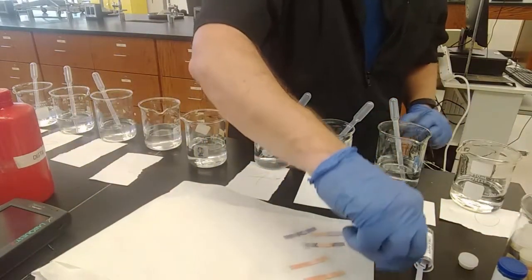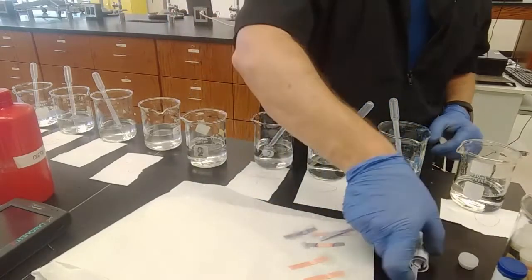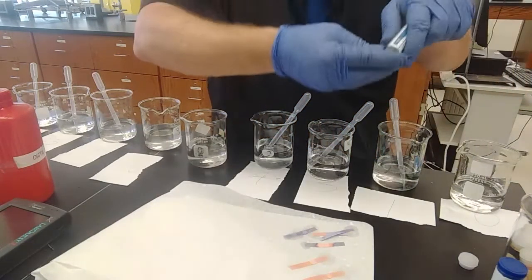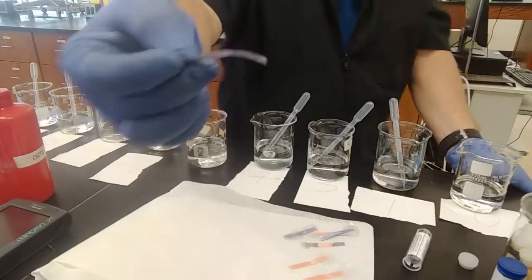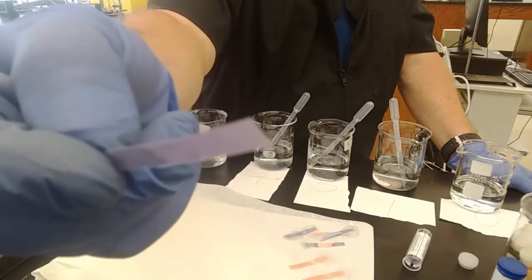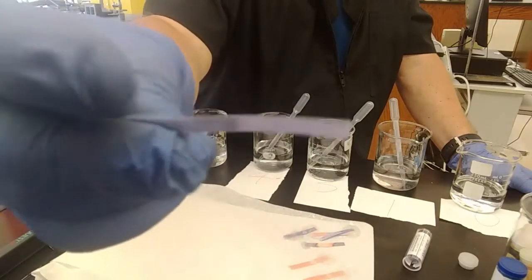You know what? Just because, try a different piece of paper. Try a different bottle. Might be an old bottle. Same effect. I'm going to switch bottles. Litmus paper. I have a different blue. Of course not. All right. Let's see what happens when we do 4. Inconclusive. It's mildly, slightly, possibly a little bit turning red, but hard to say. But based on our other test, the red didn't change and the blue didn't change either. Litmus is not that useful here.